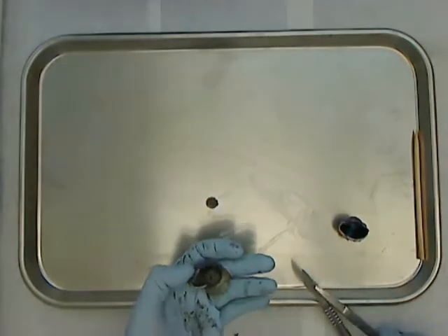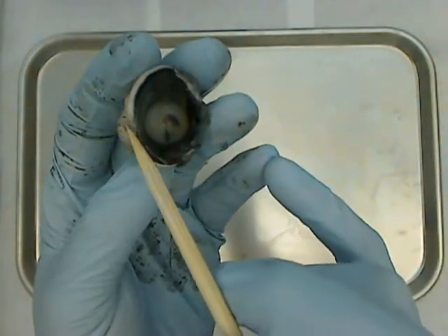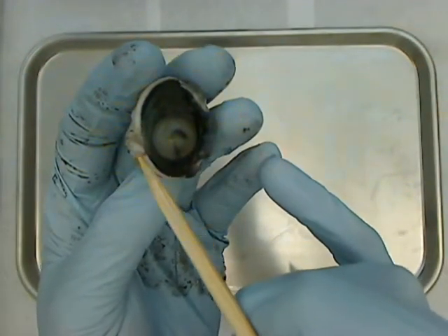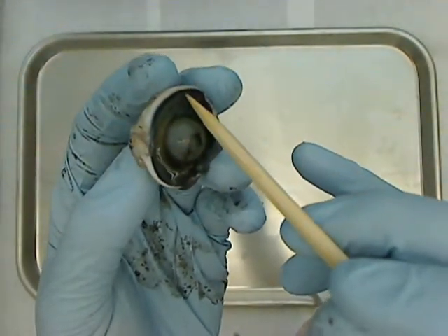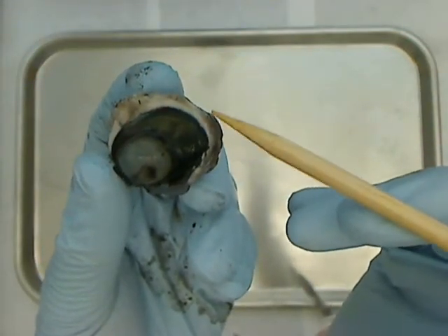I'm going to clean up this dissection a little bit. You can see the cornea, the lens, and the optic nerve leaving the eye down here. You can also see the really darkly pigmented choroid layer, and the white sclera layer on the outside.